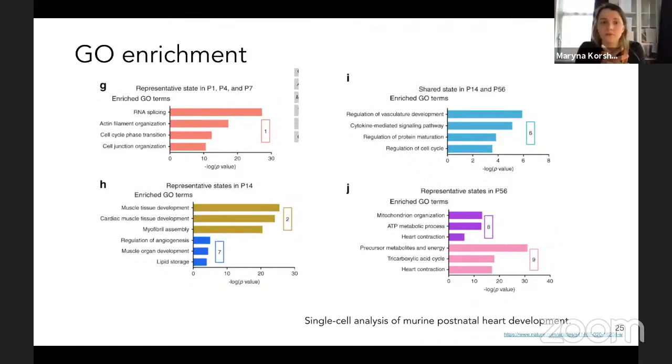For example, if some genes are related to the cell cycle or heart contraction, they will be linked to this particular process. That is why you can make your output much more informative and assume that these processes are, for example, active or intensively developed in one cell type and decreased or not present at all in other cell types. I would say it's rather an approach to make biological meaning of the data you receive.